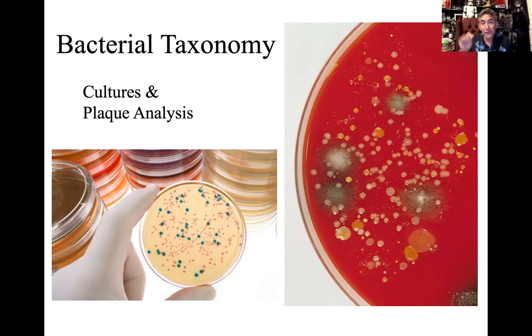You would have a cotton swab, a moistened swab, and you would scrape anything that you'd be interested in analyzing to see if bacteria was growing on it, right? So we gently swab, and then we bring the swab and streak it across our plate. Normally we do it in a side-to-side motion. This looks just kind of randomized, but we would streak back and forth, back and forth, back and forth.